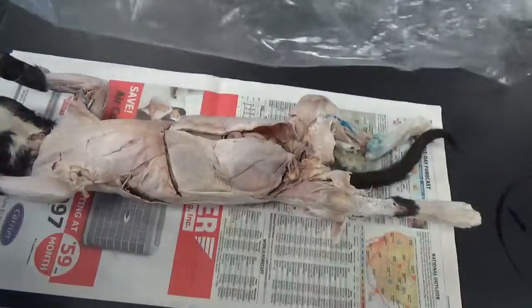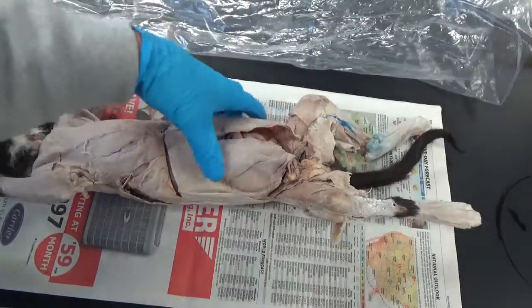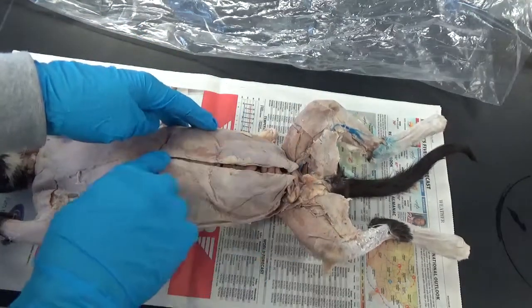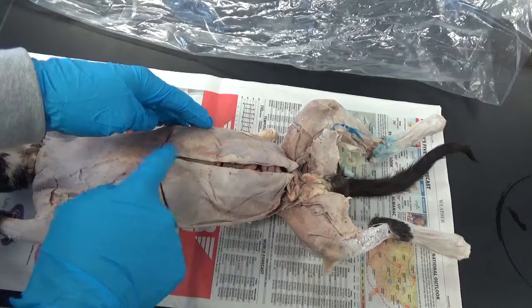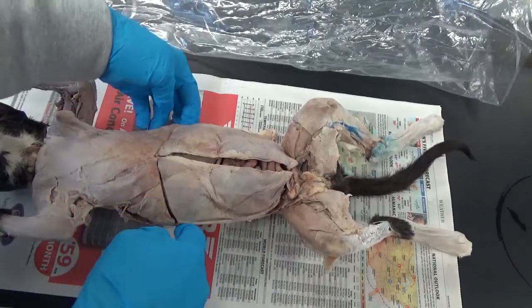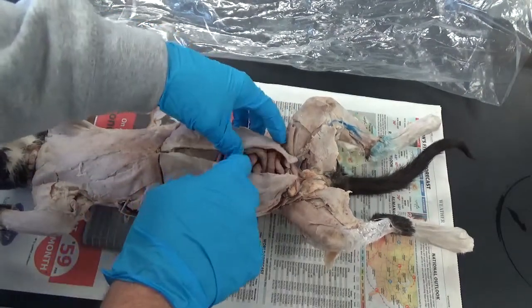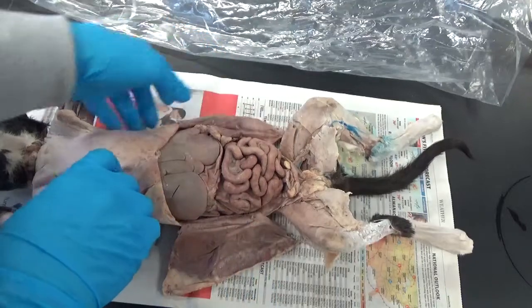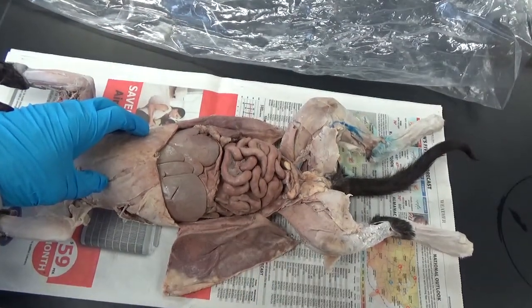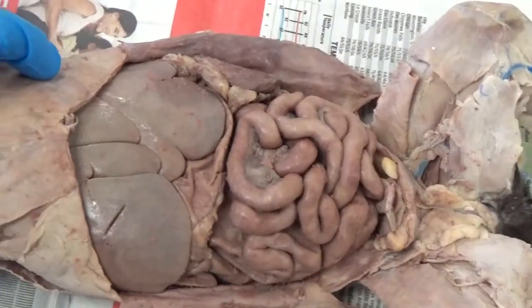We'll take a look at Clyde here. If you recall, if you were on the Zoom, we did open up the abdominal cavity. We cut up through the middle of the rectus abdominis muscles, and then margins along the bottoms of the ribs, etc. We open it up like so, and we'll zoom in so that you get a better view of things.